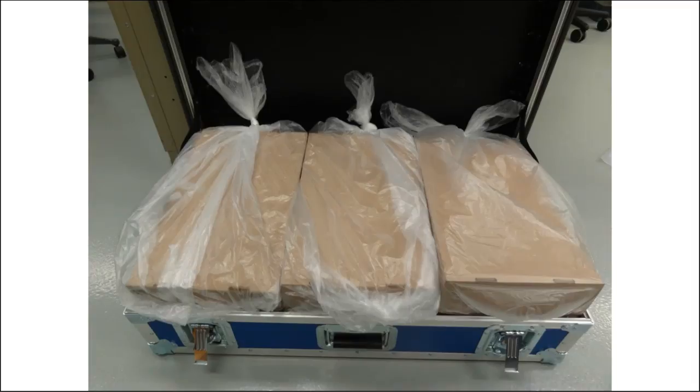And so this is the required shipping protocols that we have in the document that we must use. We ship and pack them that way just to keep us in compliance. That way we don't have to distinguish between regulated and non-regulated areas. Regulated, of course, being the ones that we can receive, and I identified the ones that you can't receive. If you have any questions about that, talk to Rich Ferguson or talk to me, making sure that we are able to receive samples from those areas if there's any questions about it.